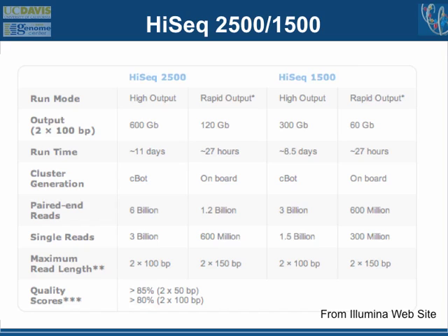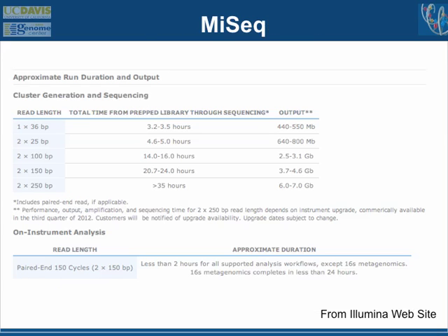But again, you can do the paired end sequencing with 150 base pairs for each sequence with the Illumina. So that's 300 base pairs basically for a single piece of DNA. Compared to when they started at 36, that's a 10-fold increase in just like 3 years of development.